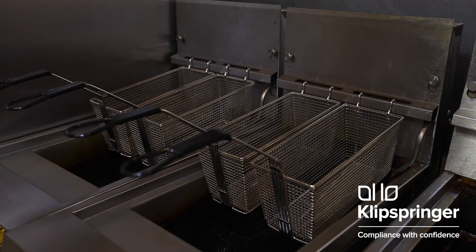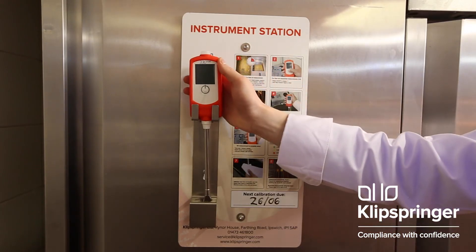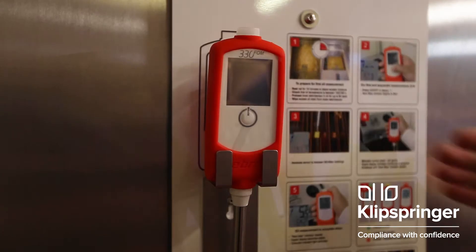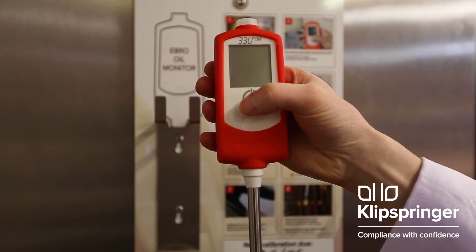When your fryers are ready for the measurement to be taken, take the FOM 330 Food Oil Monitor from the monitoring station mounted on the wall. Put your hand through the strap to get a firm grip, and press the on-off button.